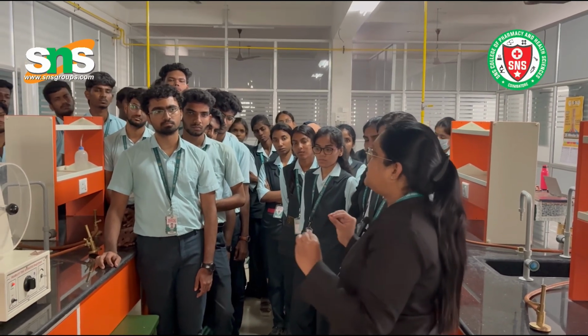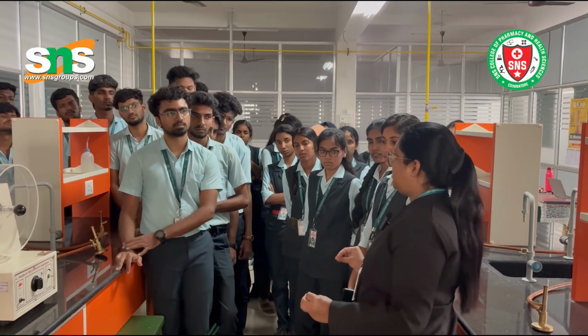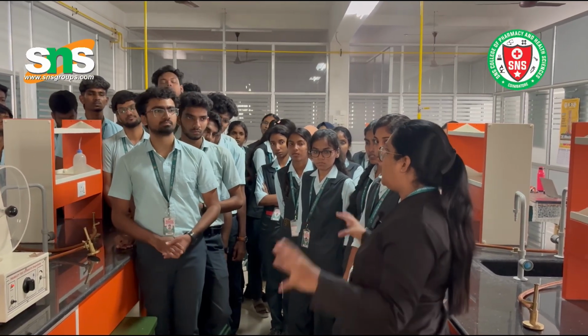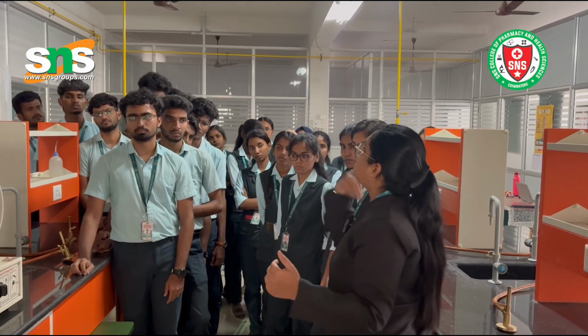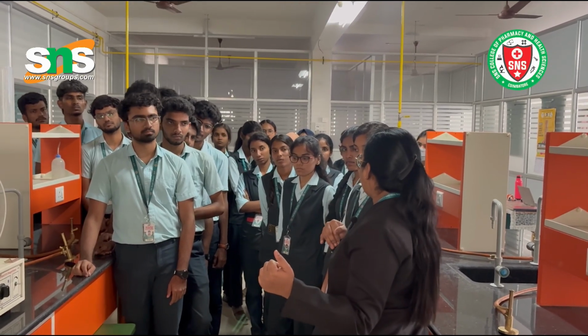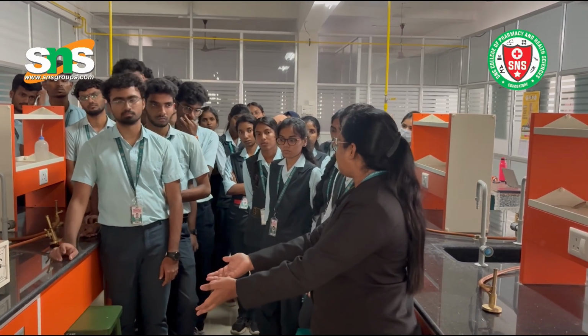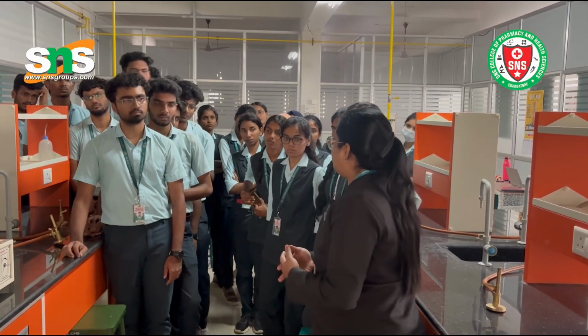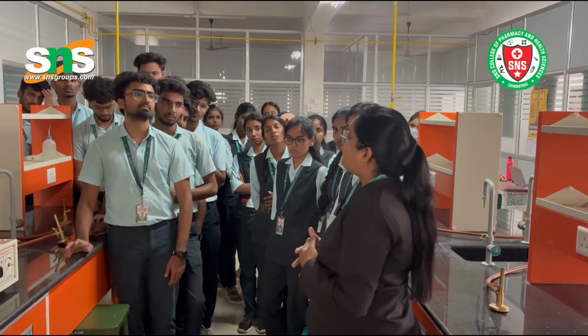Here there is a question: madam, we are doing disintegration, dissolution, hardness and all, for in vitro conditions. In vitro conditions means we are just evaluating outside, what happens to the tablet when it goes inside the body. But what about friability, ma'am? Why do we do friability?